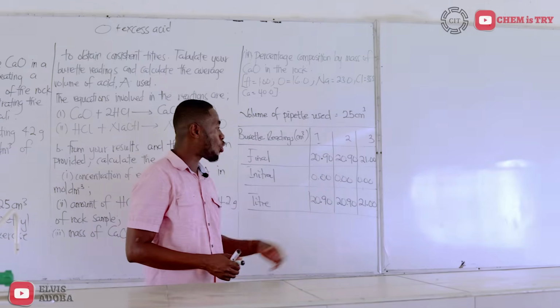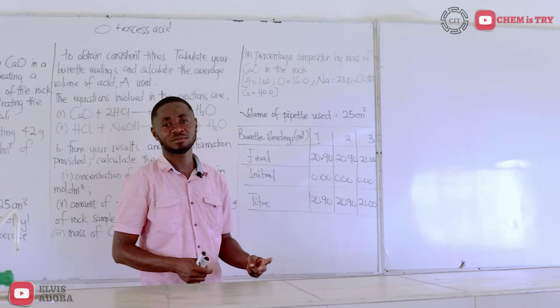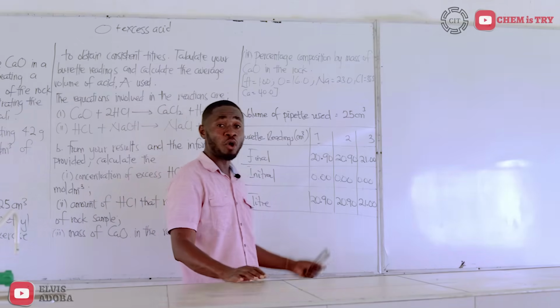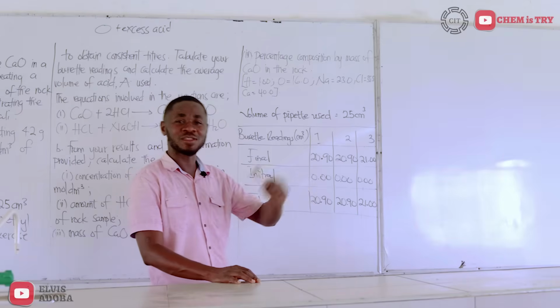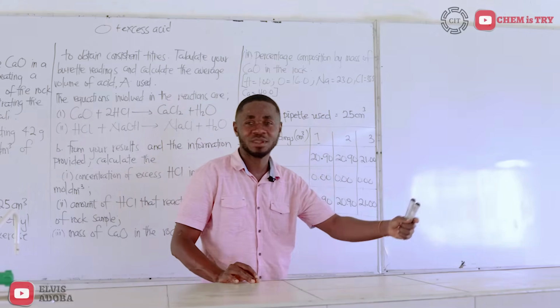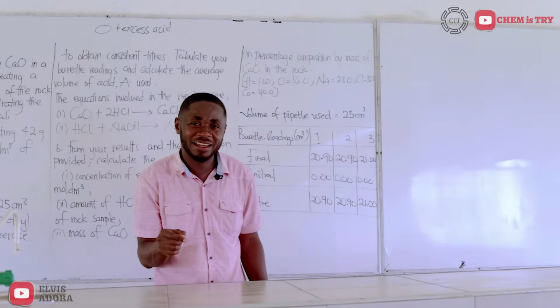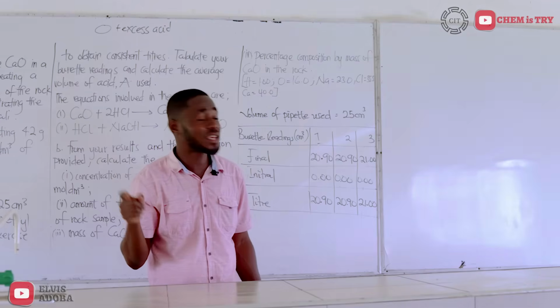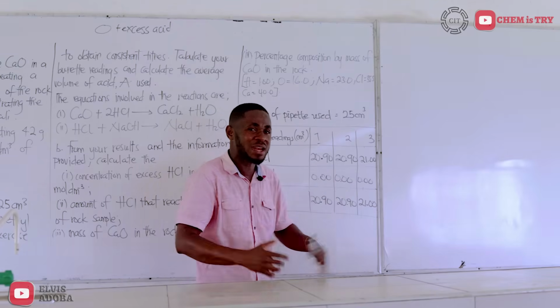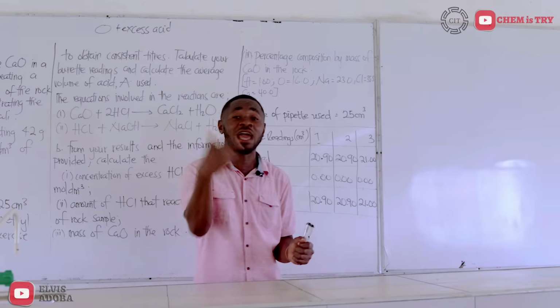All values recorded in our table should be corrected to 2 decimal places. If you look at the burette carefully, it measures 0.1, 0.2, 0.3, 0.4, 0.5, 0.6, 0.7, 0.8, and 0.9. There is nothing like 0.15 or 0.23 on the burette. So please, be careful not to write 20.91, 20.92, 20.93, 20.95, 20.98. No, it's all to 2 decimal places. But the second decimal place is just 0.